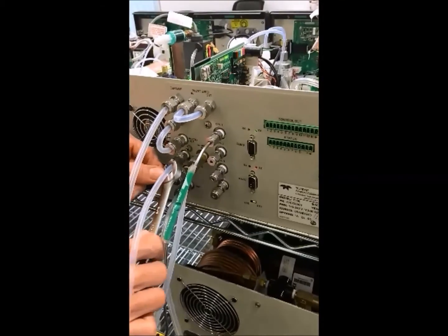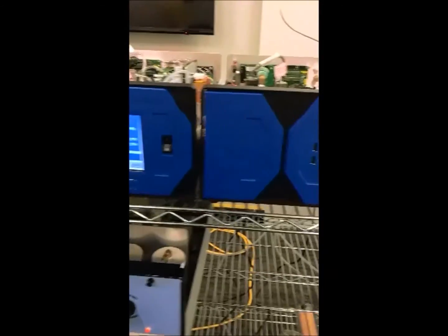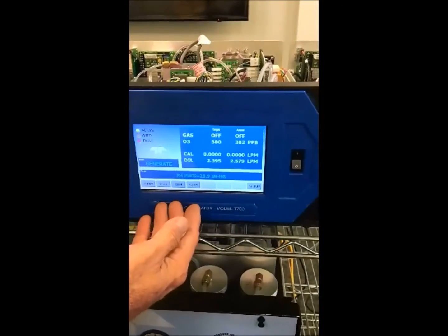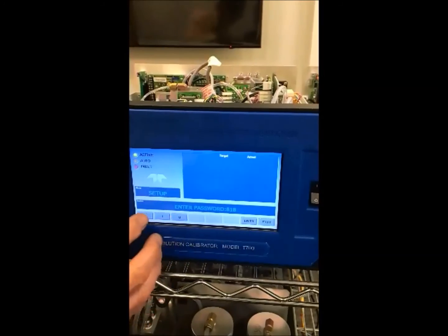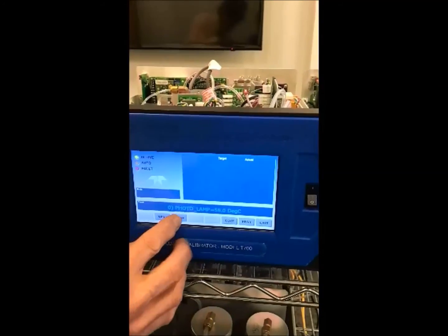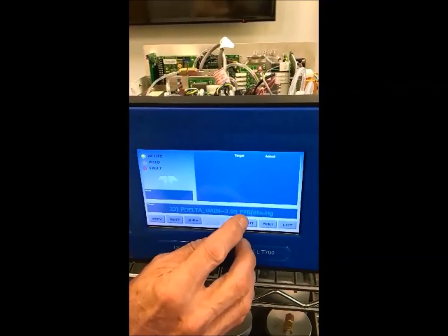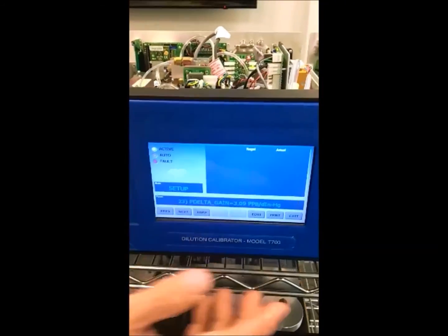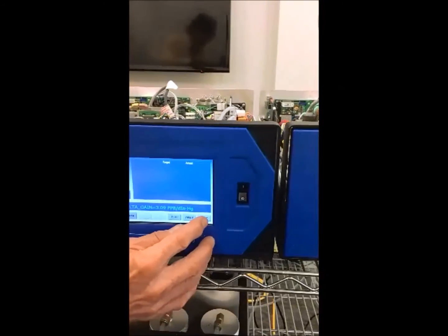Connect these back up and go back to the front. The other thing we need to do before we do this compensation is look at the back pressure compensation factor — we call it the P-delta gain. It's in bars, up near bar 23, and P-delta gain equals 3.09 ppb per inch of delta change. That's how it compensates. We write that down: 3.09.